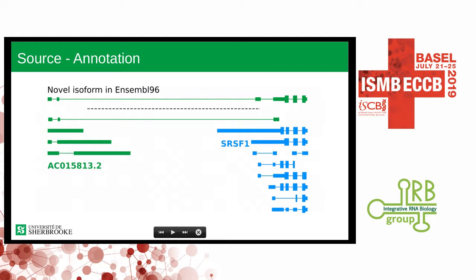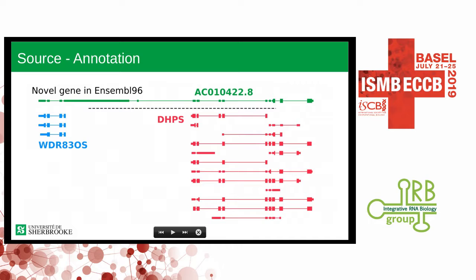So this is the annotation in Ensembl 92. We have a gene and another gene, which is SRSF1, and we have this transcript, which is overlapping only a small part. And this is a new isoform in Ensembl 96, which now overlaps a very important part of SRSF1. And this is impacting SRSF1 quantification, and SRSF1 is a highly studied splicing factor. We can also have novel genes, which have been added, which act as some kind of read-through, which now overlaps the entirety of two different genes.